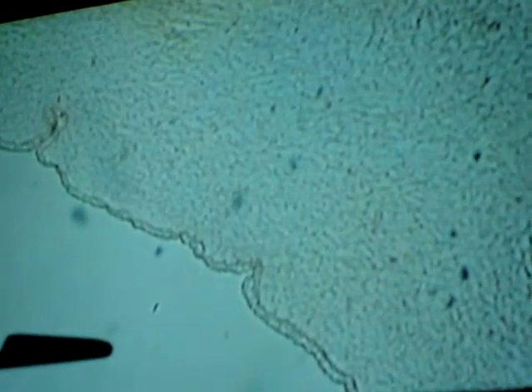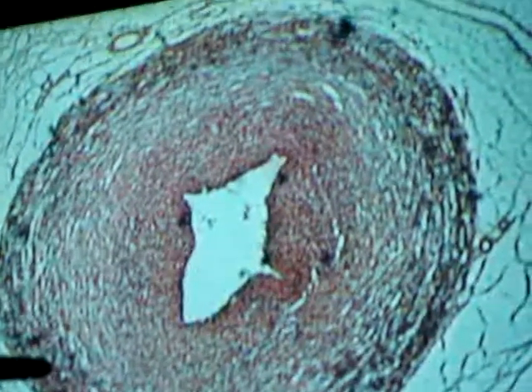Can you show one of the vein again? On the artery? I gotta compare them. So why would they be smaller? Well, they're not. It's not necessarily smaller. They're more compact. Their tunica media layer again is so much thicker and compacted together, denser. They have two of those versus the one vein, so you can think of it that way. I'm just trying to realize the difference between the appearance of the two when they look all the same size.